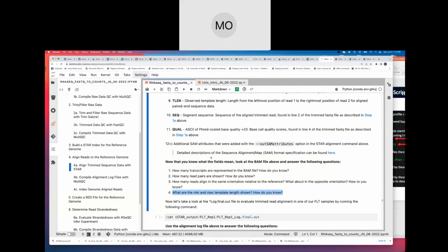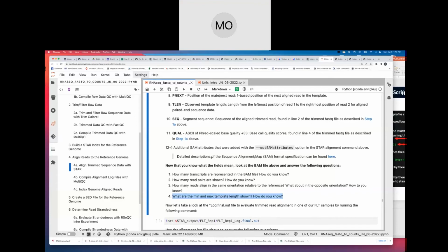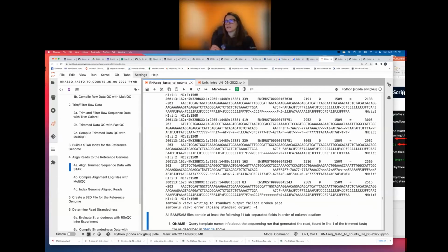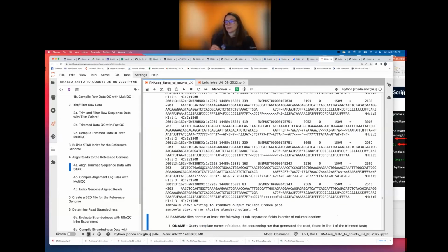Well, because I took the T length. Went to the T length and it said positive and negative. And I was remembering the figure you showed before, the starting position of the forward read and the starting position of the reverse read, and it showed the total length of the sequence, and that's what I added in the total read. Yeah, that was my logic. But looking at it now, I'm having second thoughts.